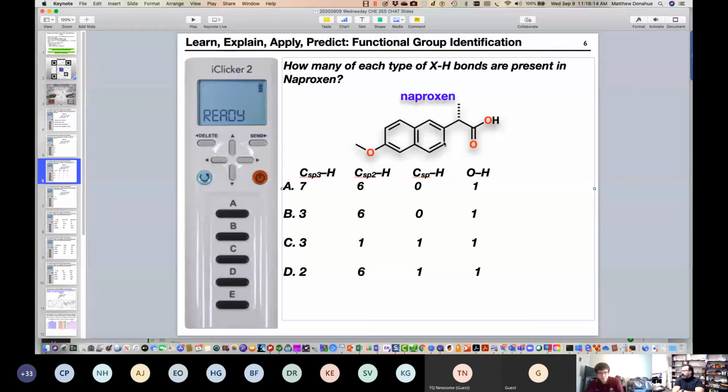Blakely is asking, what's the difference between the number of hydrogens and the number of bonds with hydrogen? So it's sort of a twofold, multi-layer concept. If we're looking at this methyl group here, CH3, and that methyl group there, CH3, each carbon has 3 hydrogens, but they are not the same type of CH3 group. Again, because of their bonding environment. If you're standing here, you look out, you see 3 hydrogens, but then you see immediately an oxygen. If you're standing here, you see 3 hydrogens, but then you immediately see a carbon. So those groups are different. They're not the same type.